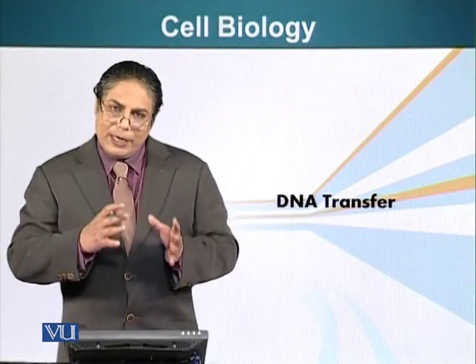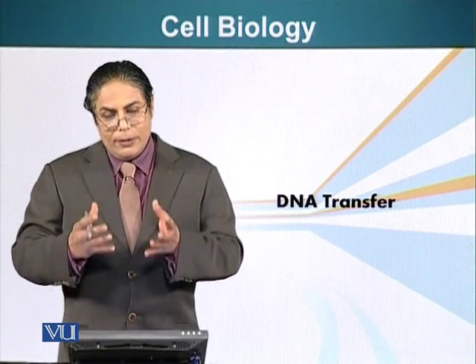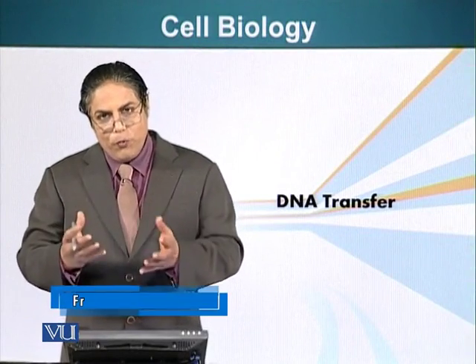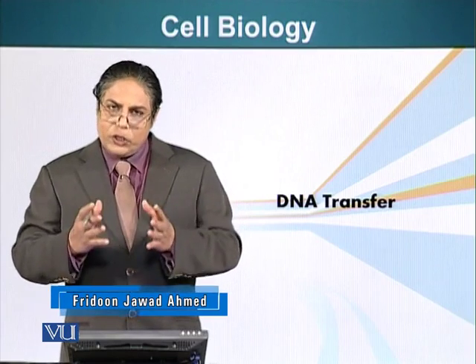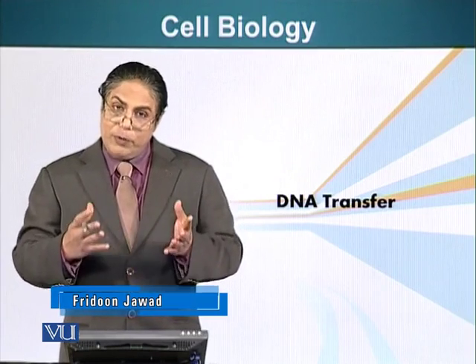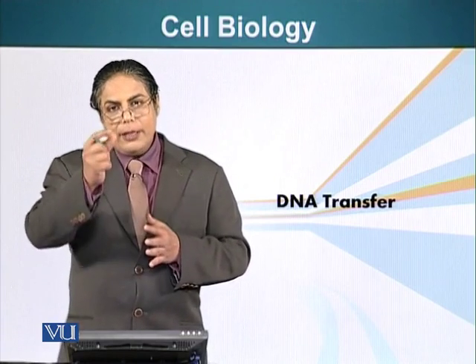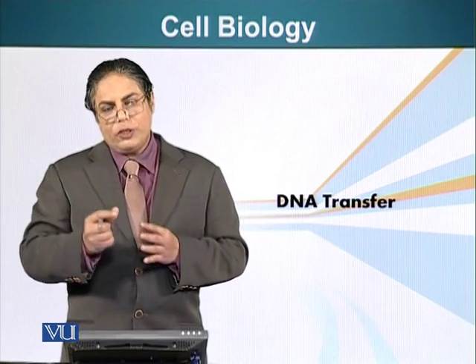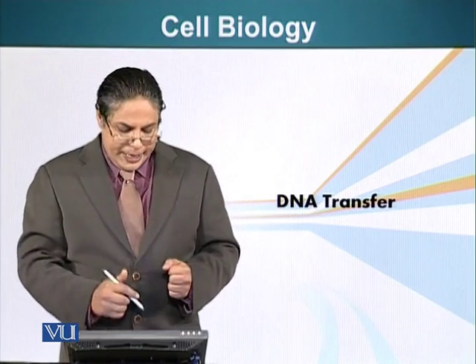We had previously cut our DNA. We are not sure whether the restriction site has been removed due to a mutation or not. How do we figure that out? I showed you a photograph of a gel which had DNA that had been cut with a restriction enzyme. The DNA is basically forming a continuous smear. How do we find our fragment in that mess? There's a special technique to do that.